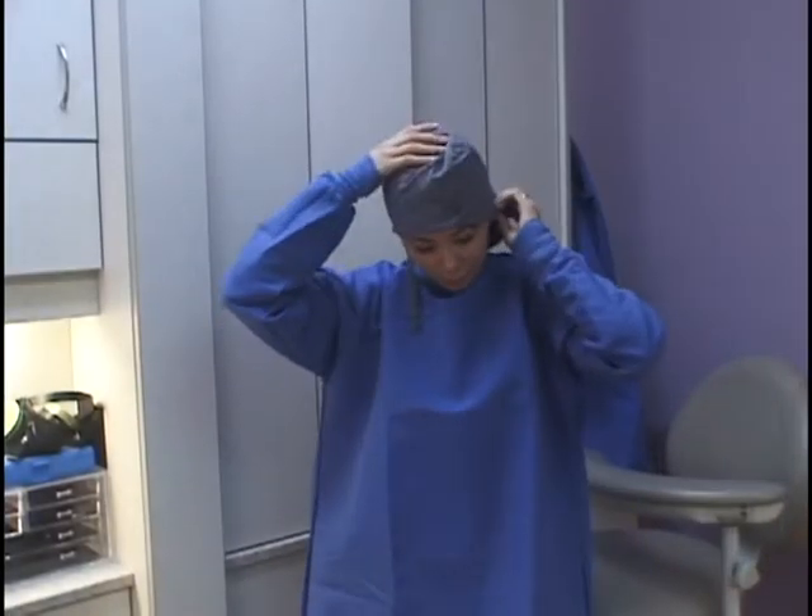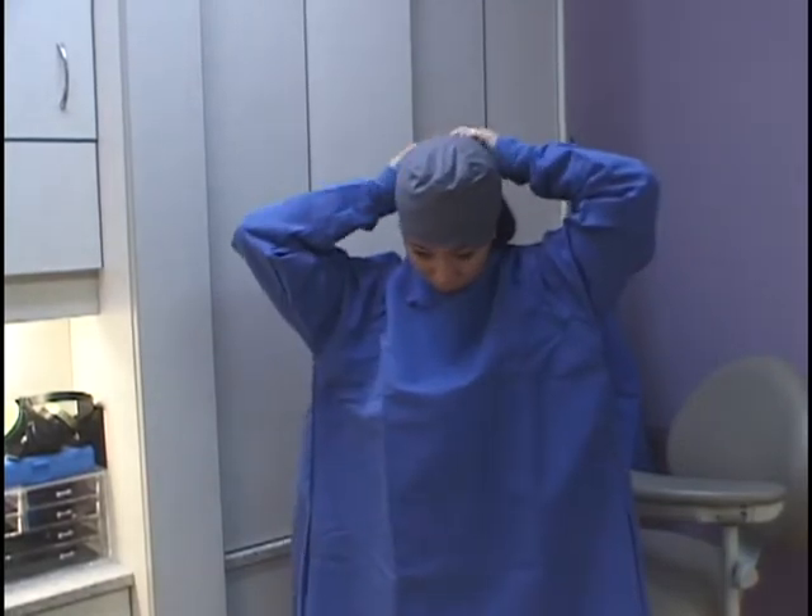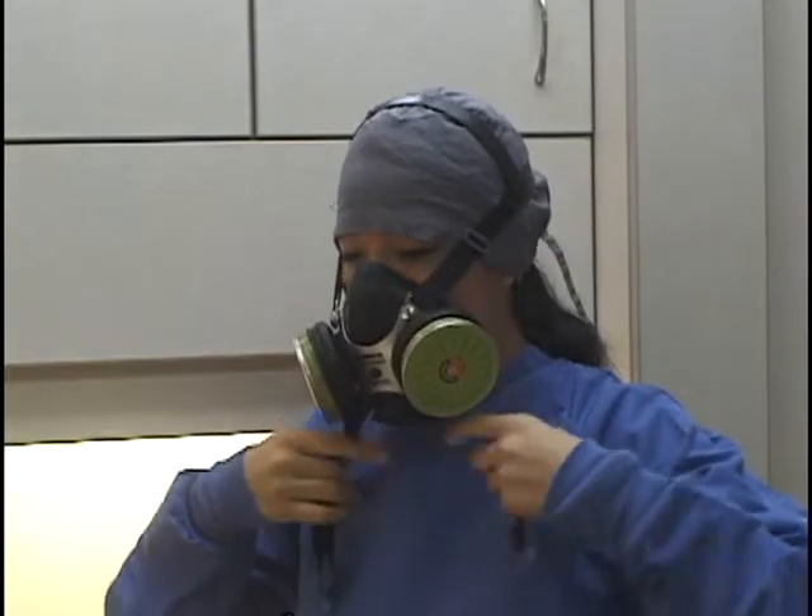Dental team protection involves covers over our scrubs as well as our heads. The most important part is the respirator mask.